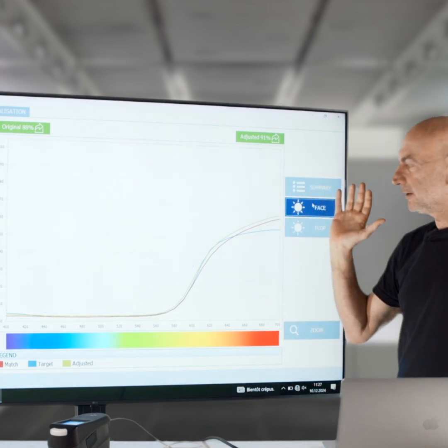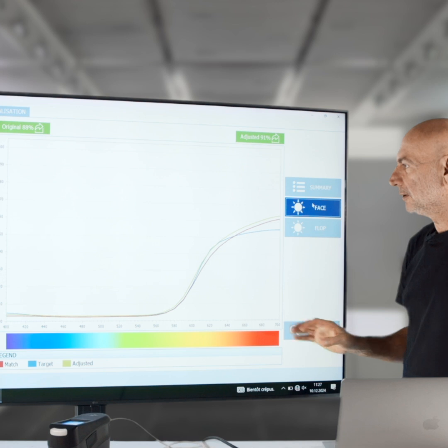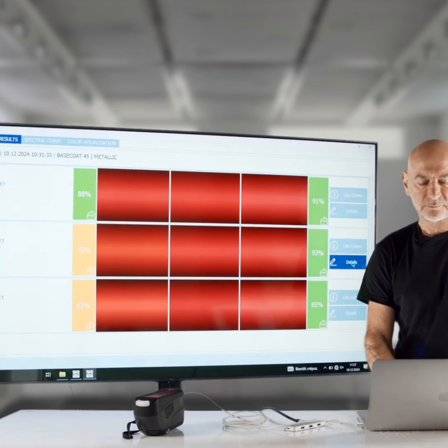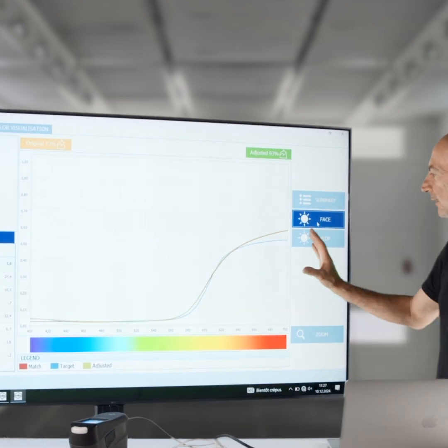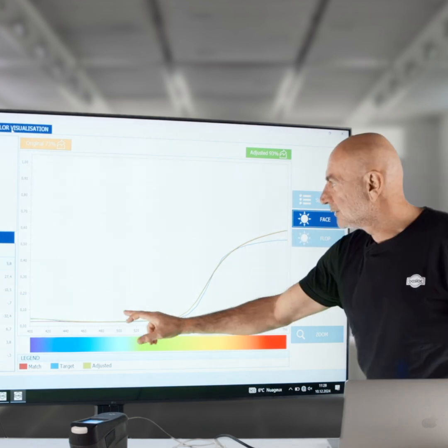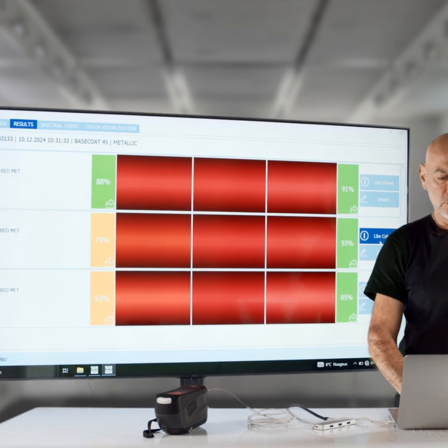What we said earlier, we don't want to have a crossing, and you can see here that there is a crossing, meaning that there is a switch of pigment in your formula. This one we absolutely don't want to go for. Let's go to the second. Here again, it's better, it's lower, but we still have this switch around of the color curve. It's giving us a very smooth, adjusted formula. But let's look at result number 3.